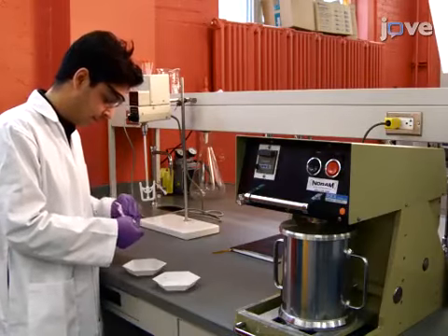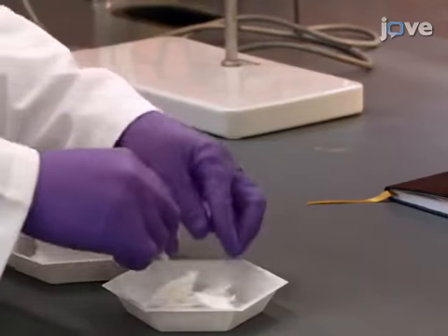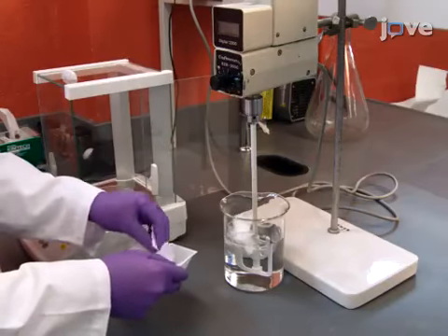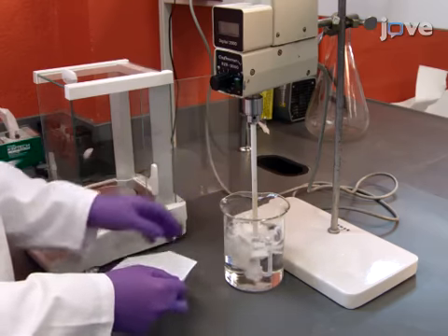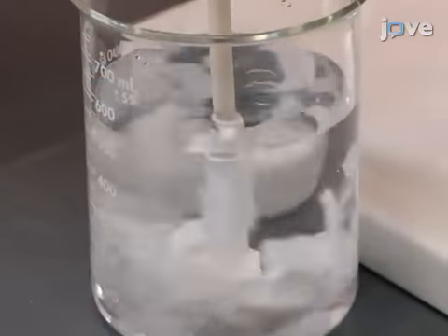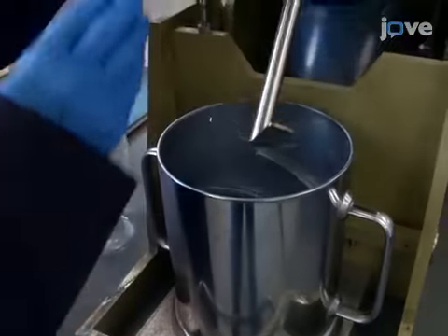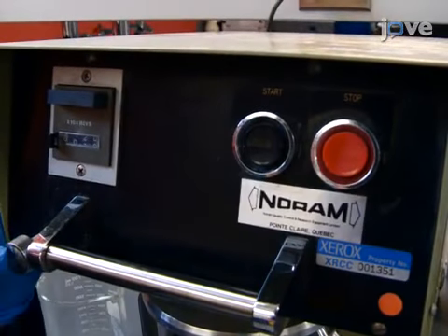To begin, tear up Q90 softwood pulp sheets into approximately 2 cm square pieces. Collect 4 grams and soak the pieces in water for at least 24 hours while stirring. Once soaked, use a mechanical disintegrator for about 3 minutes to make a near-uniform dispersion of pulp in solution.